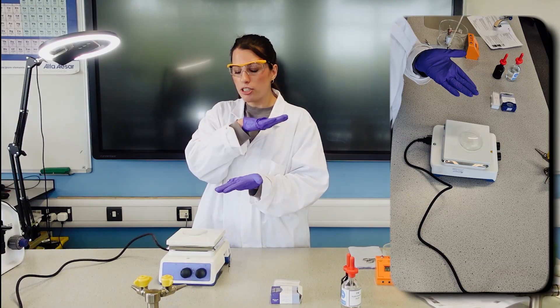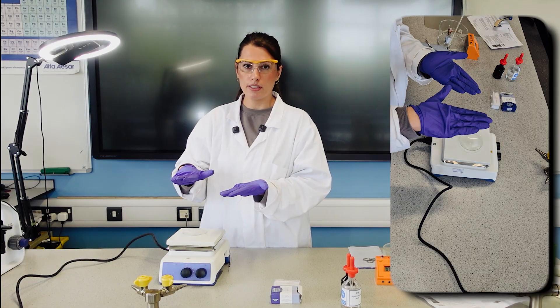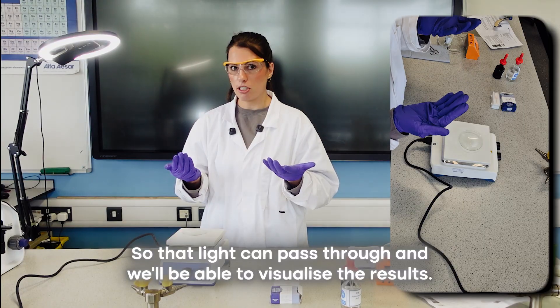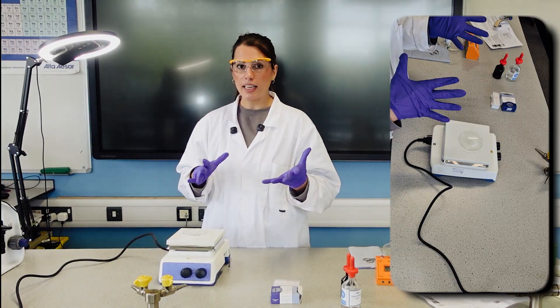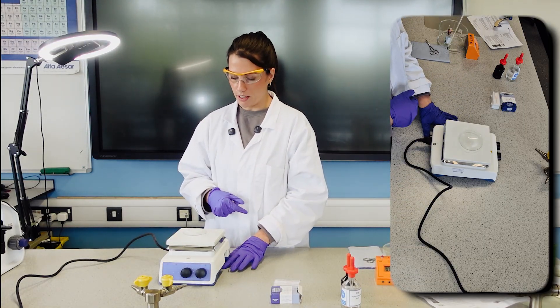All of this is to help break down the cells that are connected. So when we come to squash it, we get a single layer of cells so light can pass through and we'll be able to visualize the results. Acid also stops mitosis as we talked about earlier.